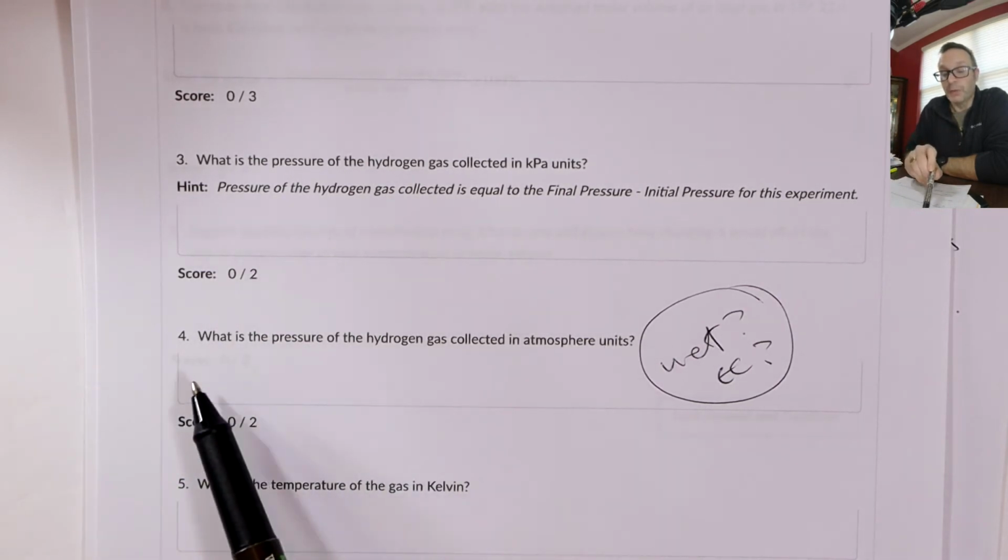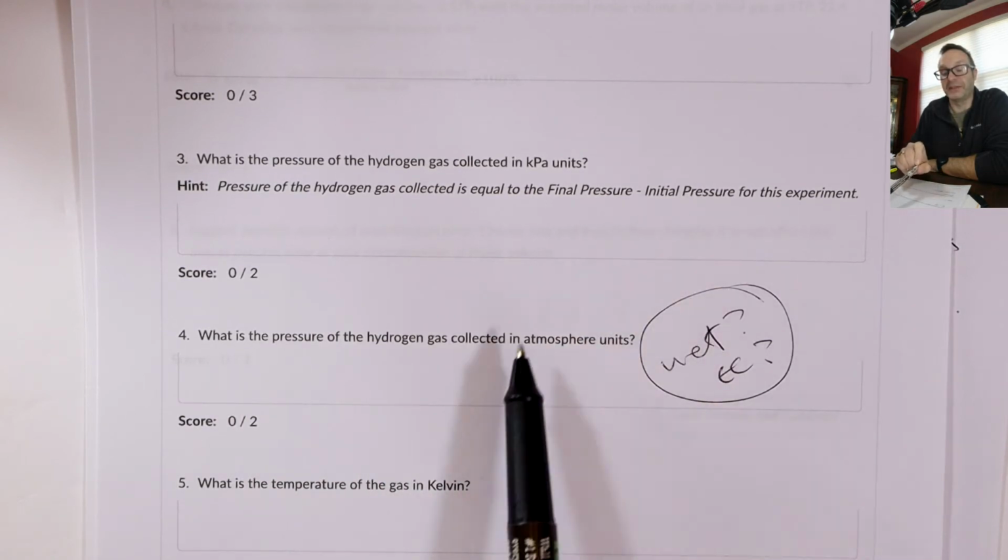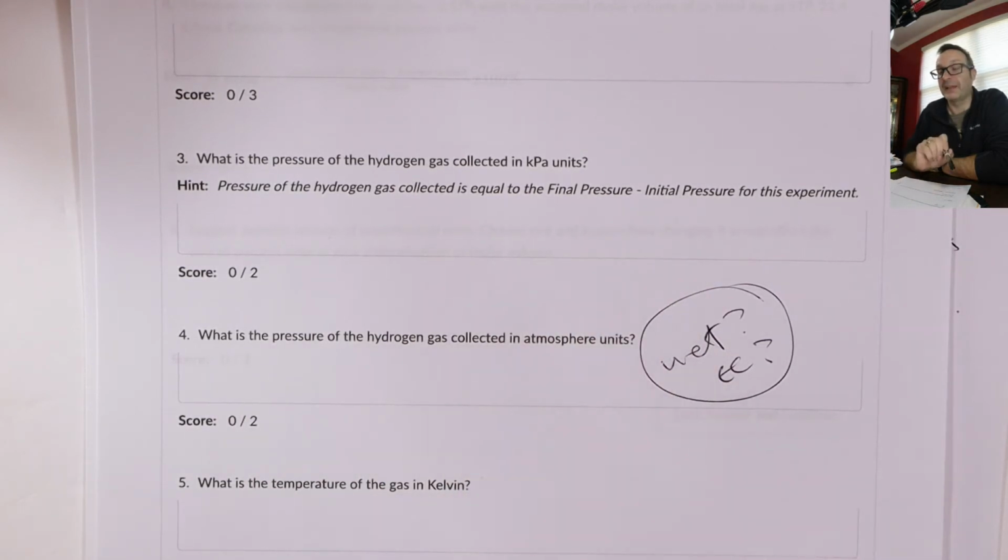So, what's the pressure of the hydrogen gas collected? It's just the difference. And if you want to make that wet gas correction, you can.